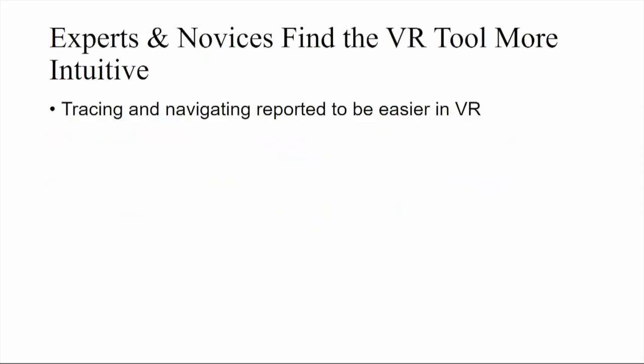In our evaluation, we found that experts and novices found the VR tool more intuitive. Performing actions like tracing the data and navigating the space were found to be easier to do in VR. Things like creating branches and correcting small mistakes using the undo system were all found to be either a little bit easier or quite a bit easier, significantly easier.